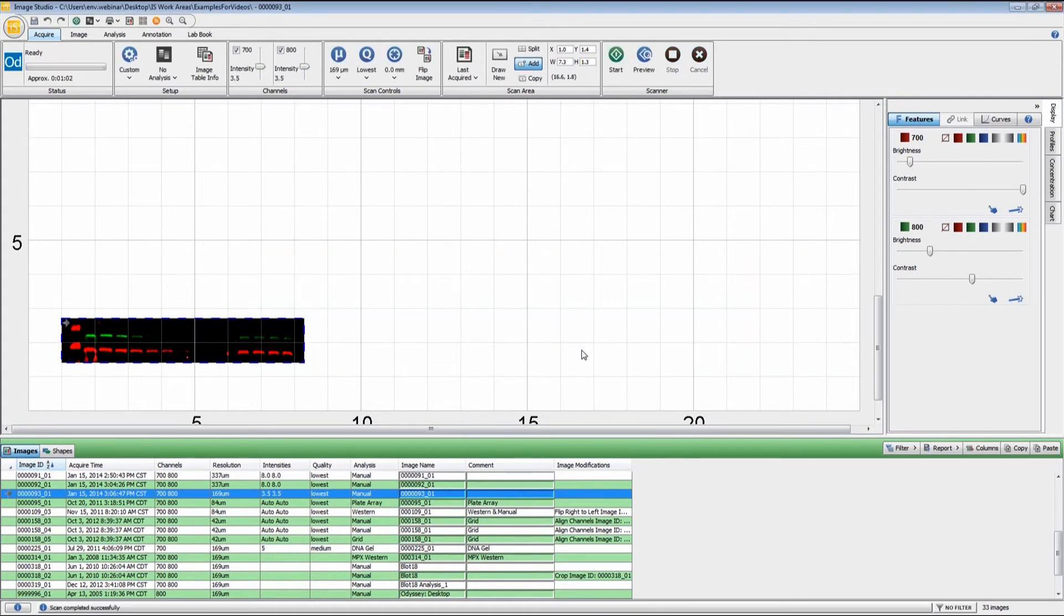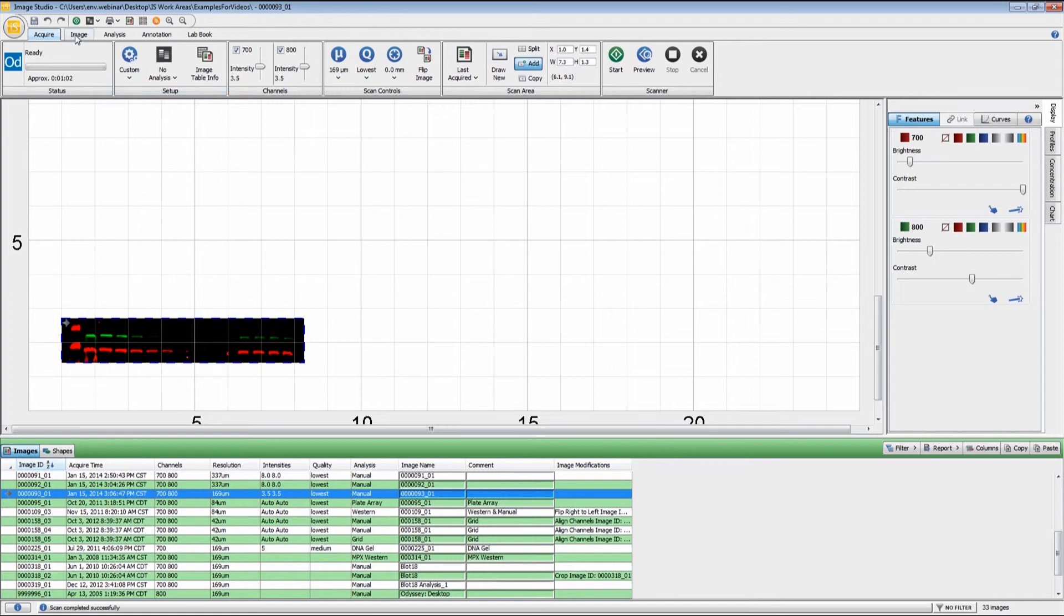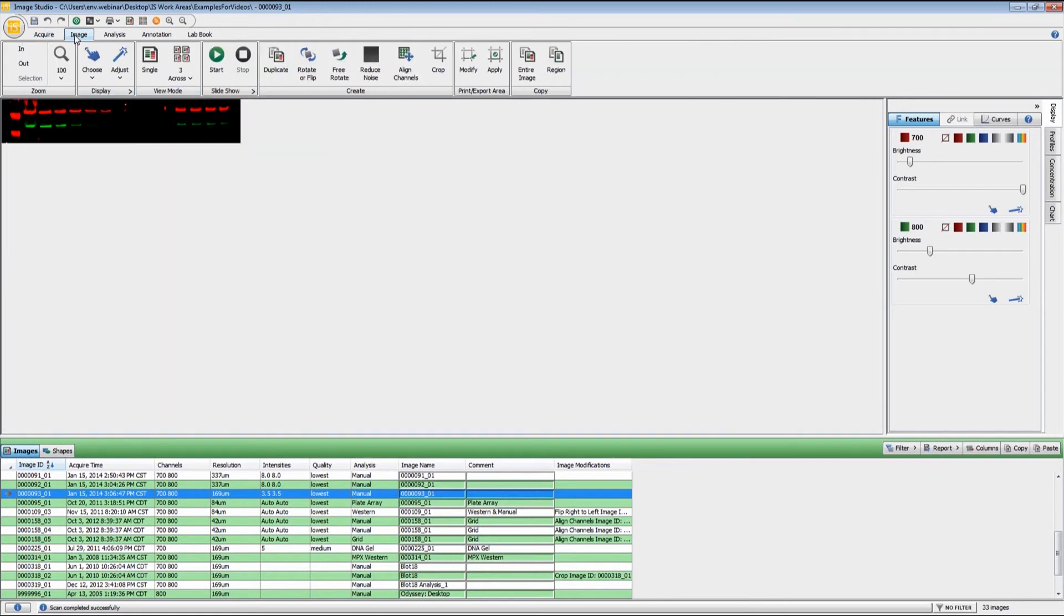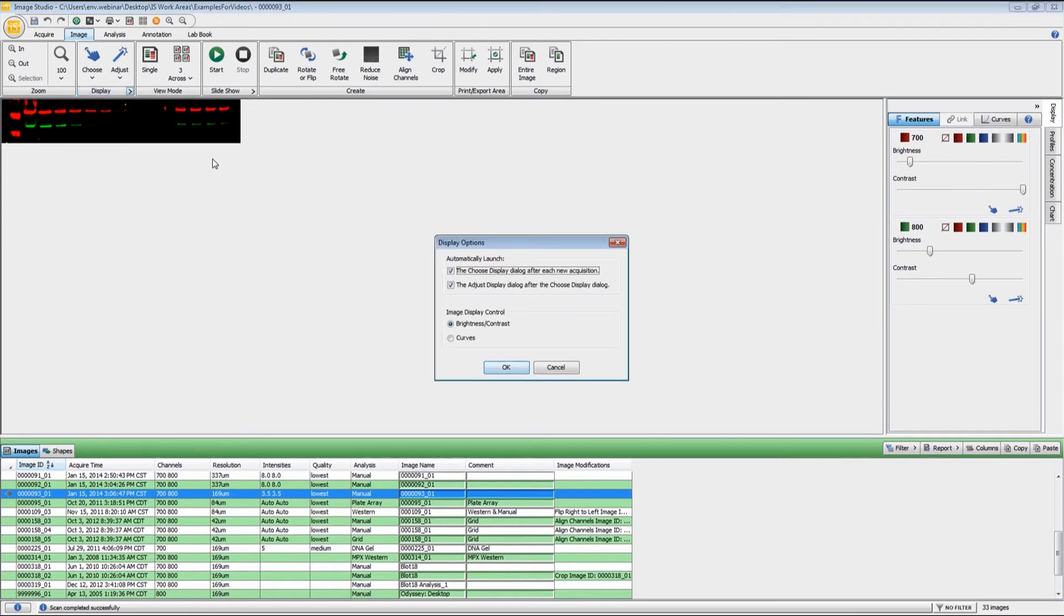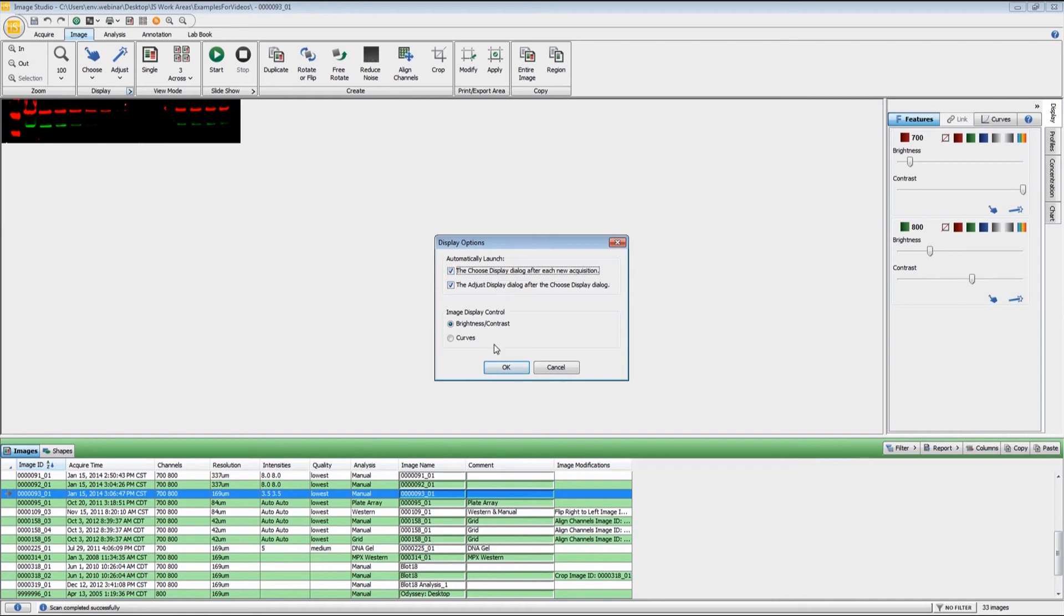If you do not want those pop-up windows to appear following an acquisition and you want to do your image adjustment manually, if you click on the image ribbon right here in the display group, there are options right here. You can uncheck these and then those pop-up windows will not appear following the acquisition. It's completely up to you. However you want to do your image adjustments is completely at your discretion.